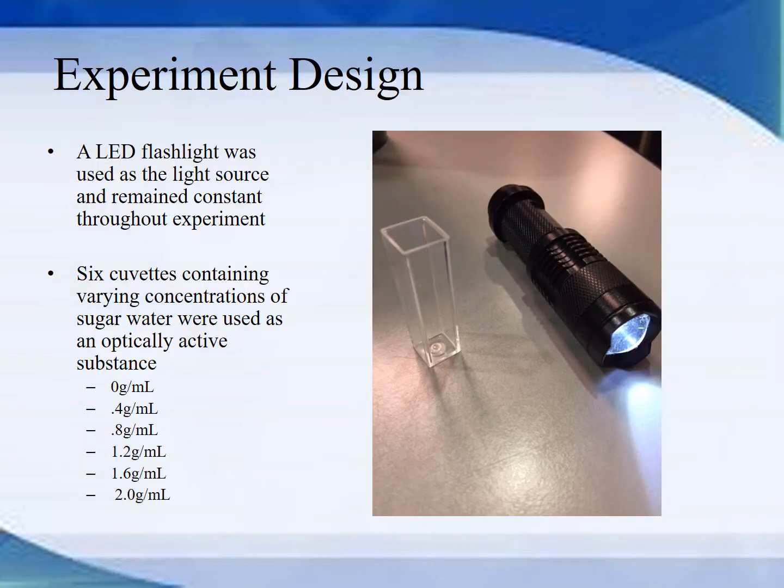So the experimental design was, we have an LED flashlight to use as our light source, and we have 6 cuvettes of varying concentrations of sucrose, and we use 0 grams per milliliter, 0.4, 0.8, 1.2, 1.6, and 2.0.